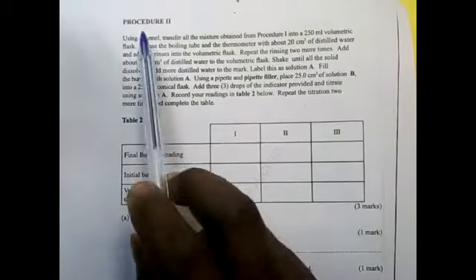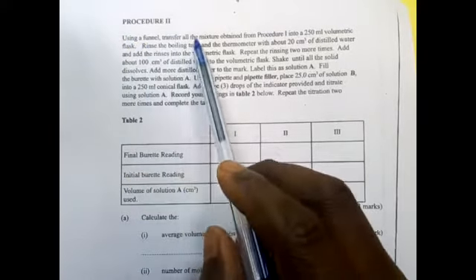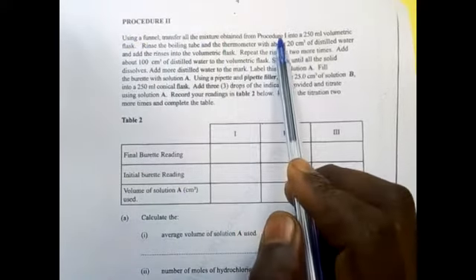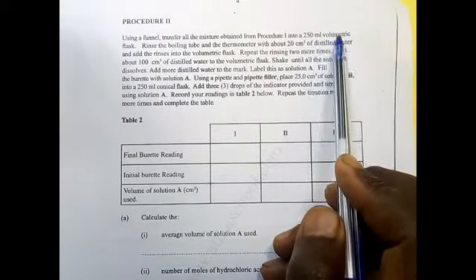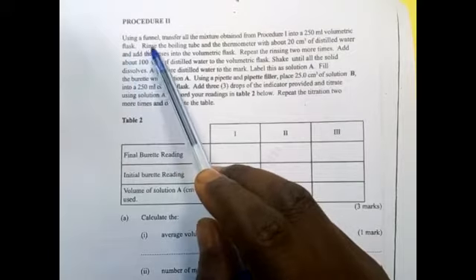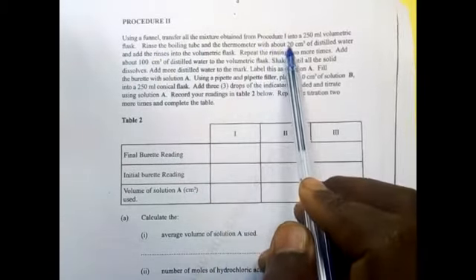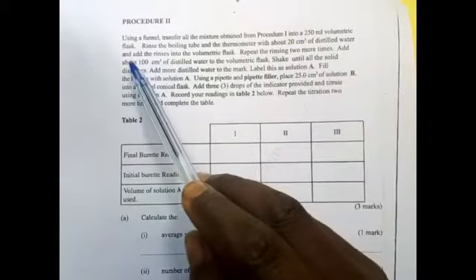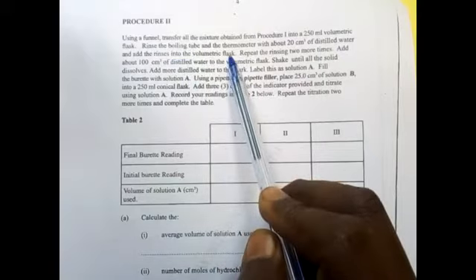Procedure 2. Using a funnel, transfer all the mixture obtained from procedure 1 into a 250 ml volumetric flask. Rinse the boiling tube and the thermometer with about 20 centimeters cube of distilled water and add the rinses into the volumetric flask.